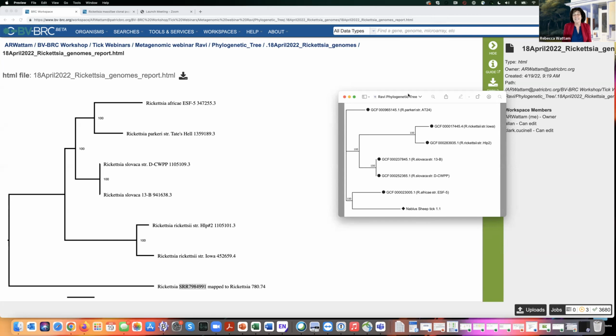I build tons of trees, and I go in and do my own pruning as well, because when I'm going to publish, I want it to be the best tree possible, with the best representatives. So I am very careful on what I include. And I know it sounds vain, but I also limit how many genomes I include, because I want it to look good in a publication. At first I'll run everything, and then I'll start pruning down. But also this report, and I'll show you, will give you some hints about what to include.